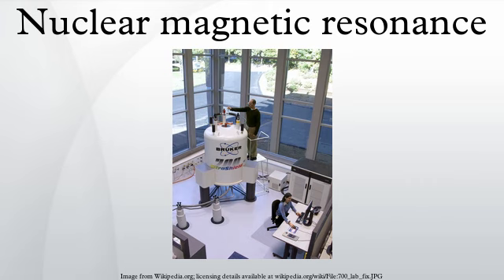Zero-field NMR. In zero-field NMR all magnetic fields are shielded such that magnetic fields below 1 nT are achieved and the nuclear precession frequencies of all nuclei are close to zero and indistinguishable. Under those circumstances the observed spectra are no longer dictated by chemical shifts but primarily by J-coupling interactions which are independent of the external magnetic field.